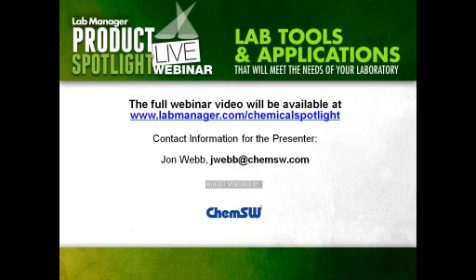Capturing those materials as they arrive, with one dedicated person or maybe a couple of dedicated people receiving those bottles as they arrive. The researchers can still place them on order, but when they're received by that personnel, they're actually put into the individual's inventory. That way the researcher doesn't have to worry about doing that work, and it can be easily identified as their own personal inventory.